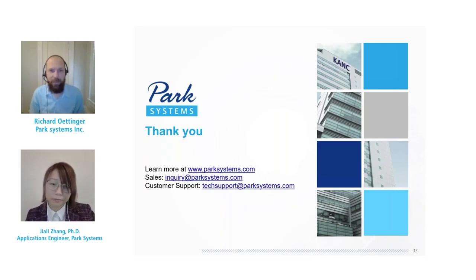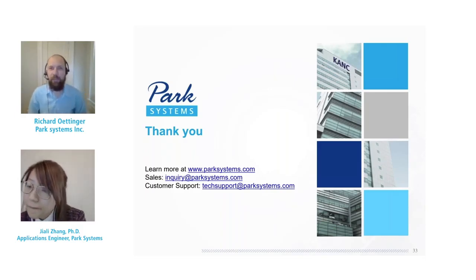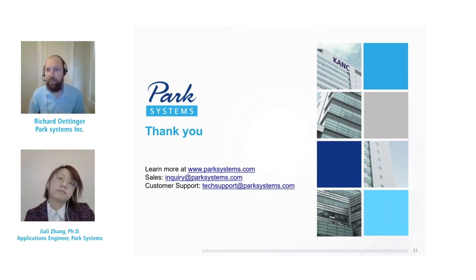All right, thank you very much for the presentation. We do have 2 questions so far that I will ask, and if anybody else comes up with a question, please use the raise your hand feature or type it into the questions module. First question is, how do you quantify tip radius?